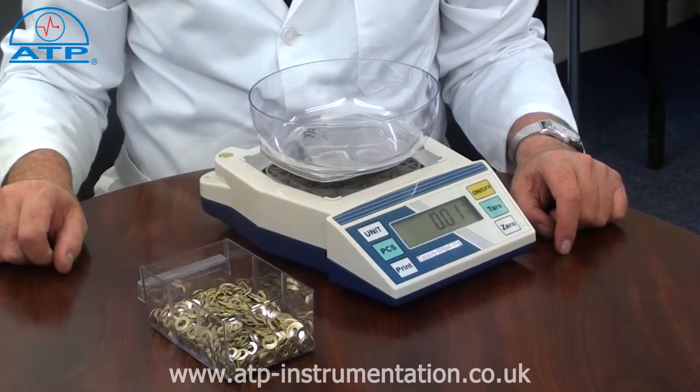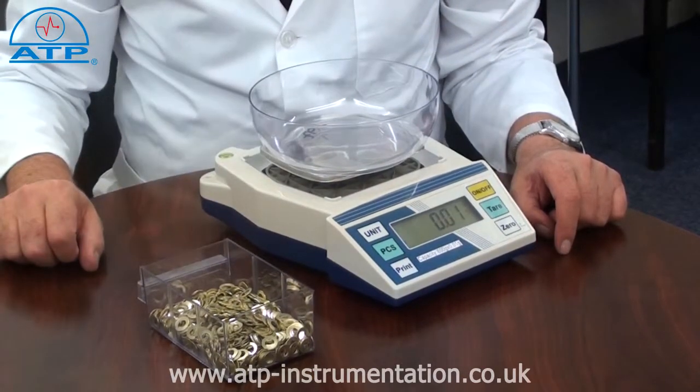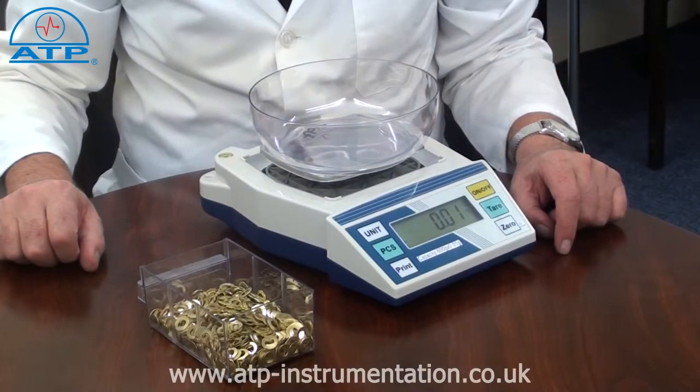The higher the sample count, the better the accuracy of the count will be. By then placing an unknown quantity of parts onto the platform, the scale will calculate and display the total number of individual parts. These scales are supplied with a two year warranty.